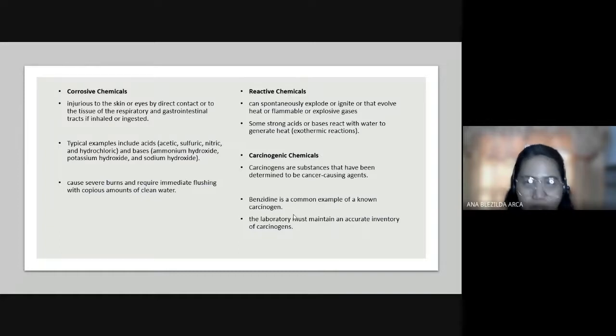Okay? So wag na wag niyo nang gagawin yun na nataptapunan ka ng acid, tatapunan mo sarili mo ng base, ano yun, 'di ba? Lalo mong pinalala ang sarili mo. Okay? So kapag hindi siya naagapan, it can cause burns. Pwede siyang umabot sa third-degree burn.